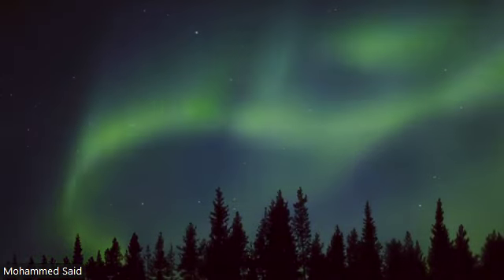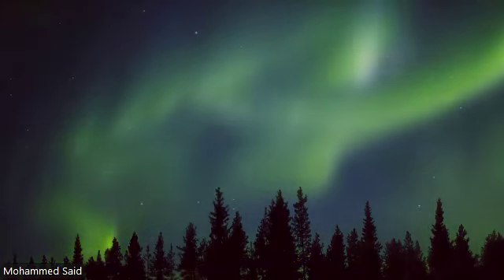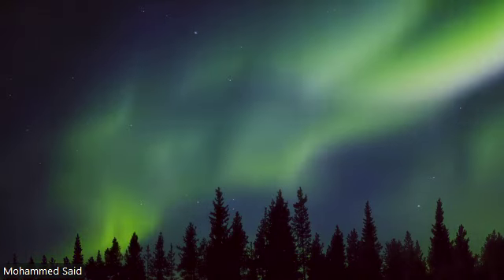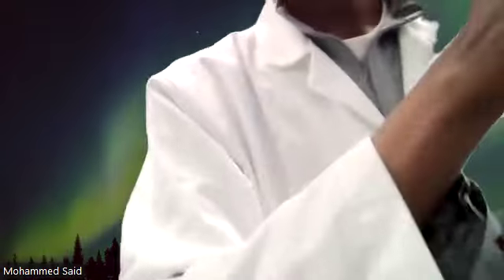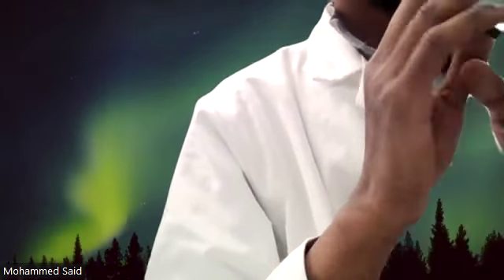Remember, you have 6 plates. You label them with your group letters, the exercise, the factors, the bacterial time points and temperature. So bear that in mind. That way next week, inshallah, you see your results. So that's my final message for you guys for our exercise for today.